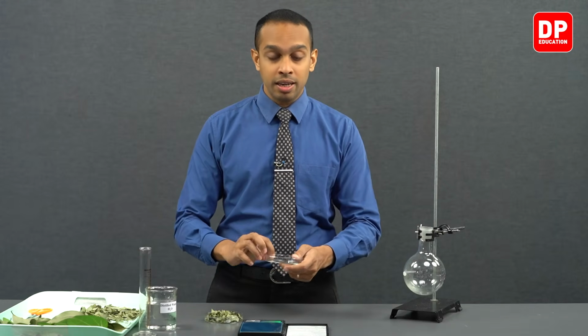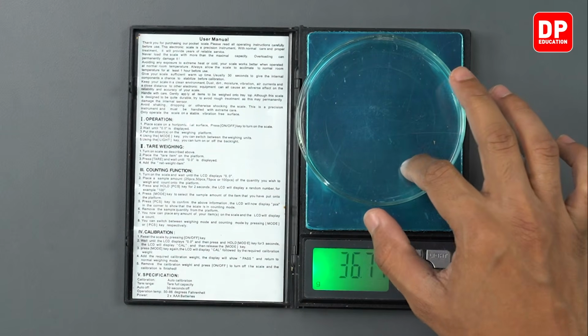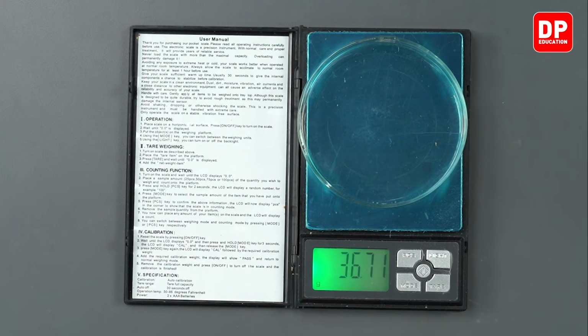We are going to take an empty petri dish and place it on our digital balance, and use the tare function to get a 0 reading on the digital balance. Now, in our practical, it is advised that we take 5 grams of cinnamon leaves.